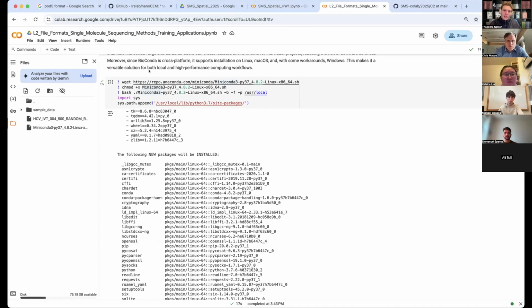That's really the real part of what Conda is about. It's this package manager that lets you separate different programs into different environments and install their dependencies independently of each other. That's very important for making sure you're able to run each program within a pipeline, even if they don't share all of the same dependencies. And ultimately, when people talk about transferring software, they're transferring a piece of code and a code base, but also all of the versioning for the dependencies that they might be working with.